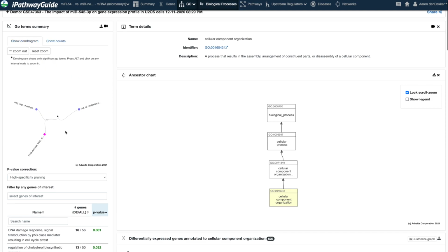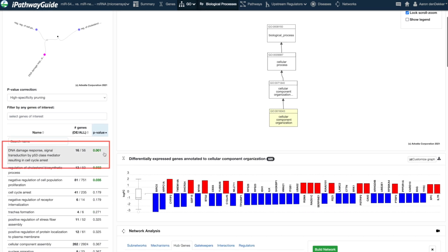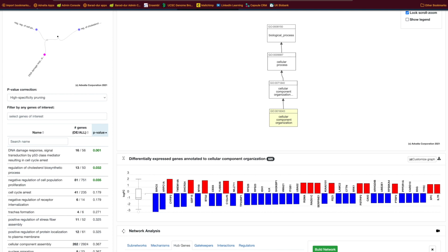The very first one pinpoints the involvement of p53, which was the very title of the paper describing this work. The second process mentioned in the abstract, negative regulation of cell proliferation, is also one of the top 3. We have now eliminated hundreds of false positives, leaving more time to devote to better understanding the data.